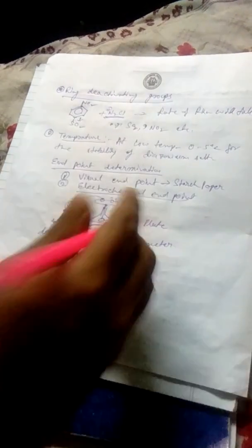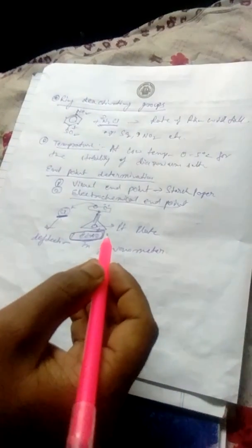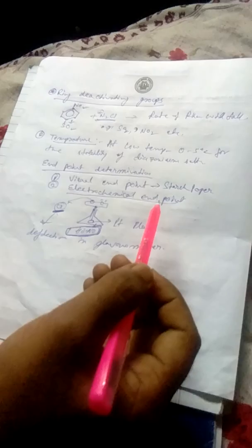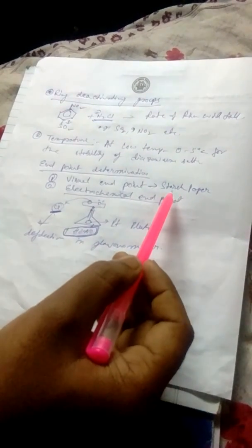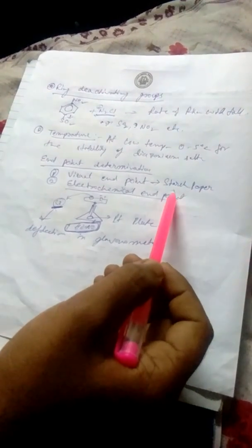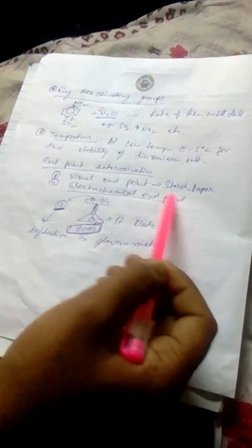And through the electrochemical endpoint, we get a sharp endpoint which is more accurate than starch paper, because at some interval we have to put some solution from this conical flask and pour it upon the starch paper, but we can't exactly measure the exact value where the endpoint occurs.